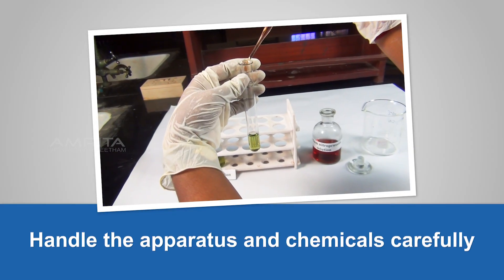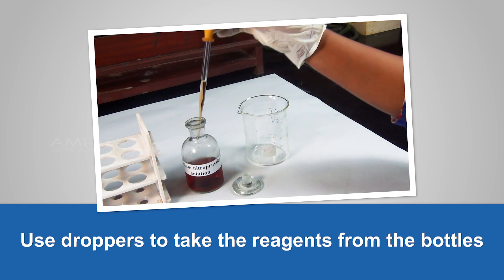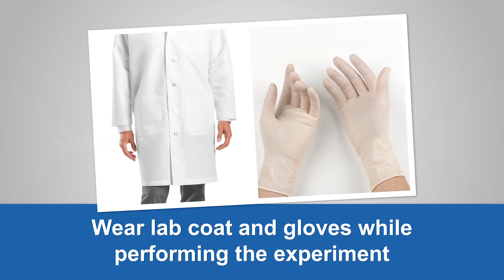Precautions: Handle the apparatus and chemicals carefully. Use droppers to take the reagents from the bottles. Wear a lab coat and gloves while performing the experiment.